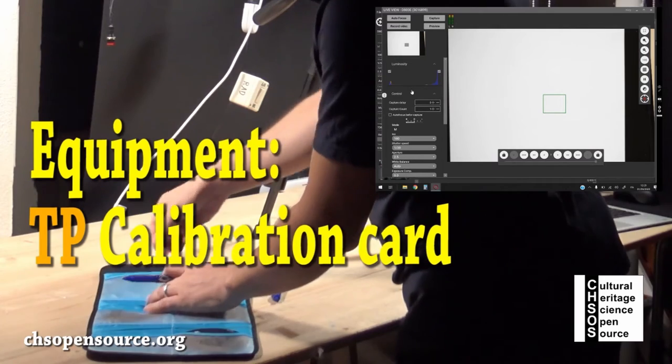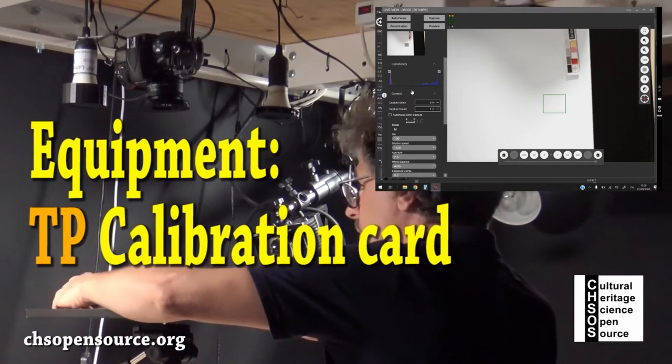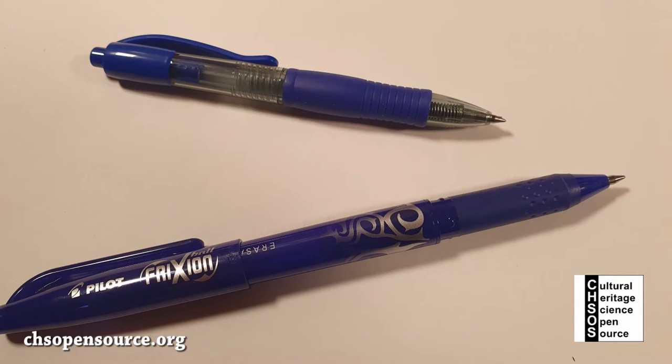We add the technical photography calibration card. The red spot is cadmium red. These are the two blue pens we will use for the test; one is an erasable pen.